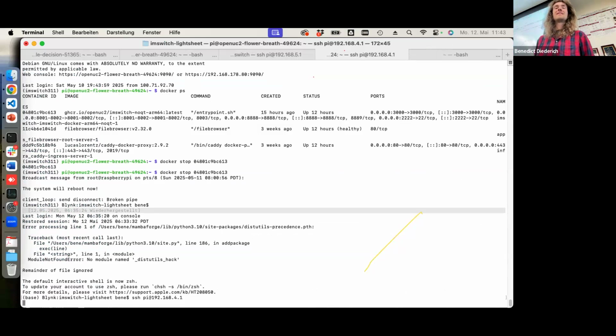So this is just an empty space thing. So there the filter goes. Oh, okay, I see. Let's wait until this is back.